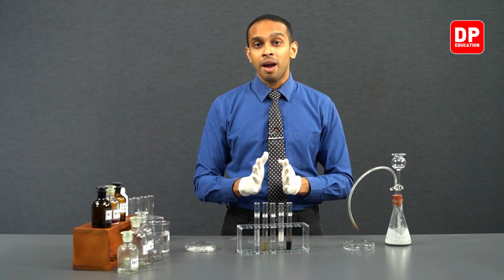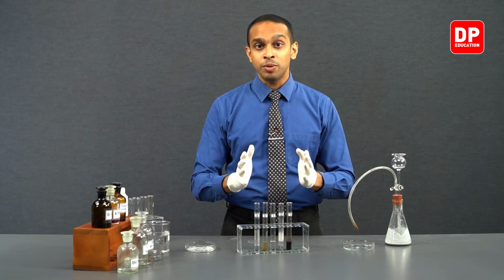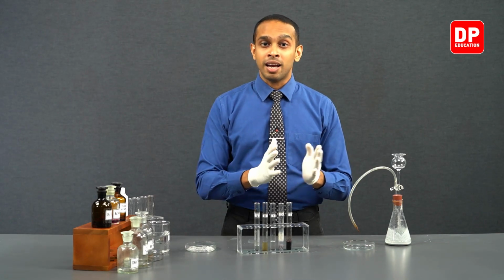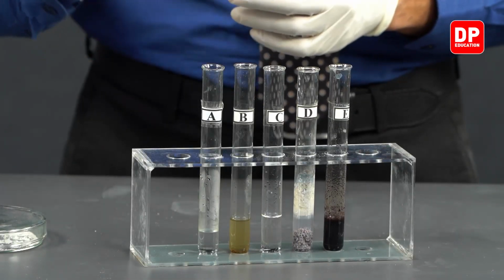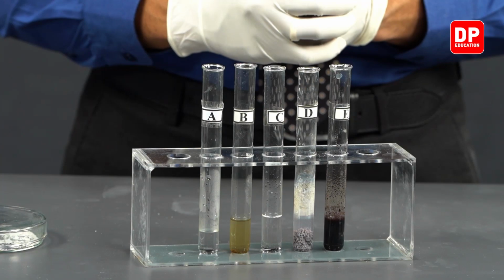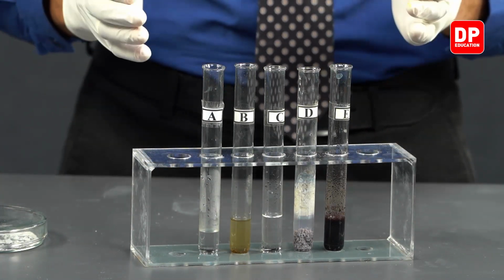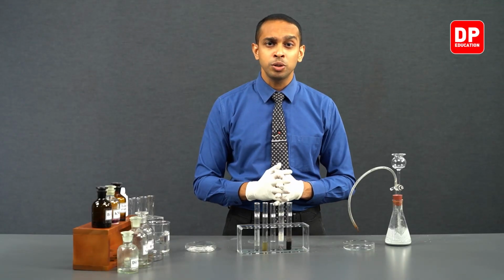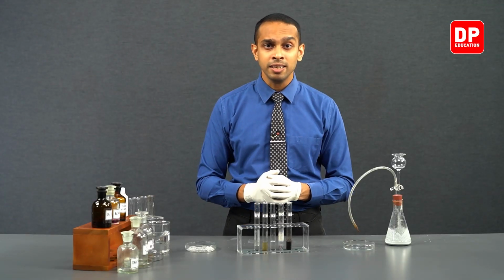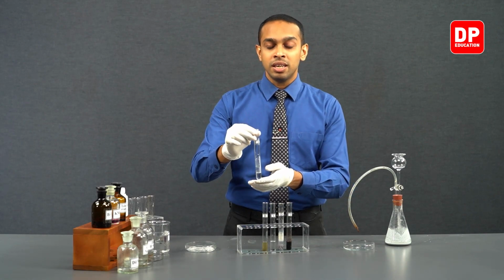So as you know, alkynes are unsaturated hydrocarbons, which is due to the fact that alkynes have a triple bond in them. So ethine has a triple bond, so therefore it is capable of reacting with the bromine in bromine water. As the bromine molecules got used up when reacting with ethine, the color of the bromine water got decolorized.